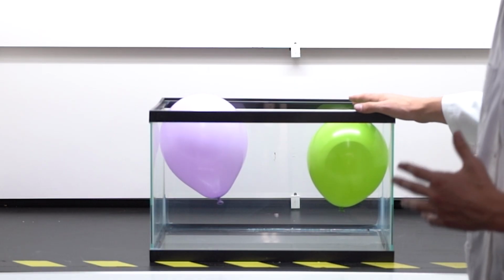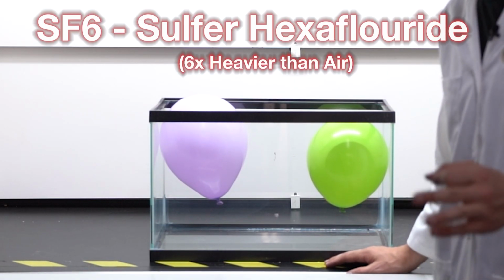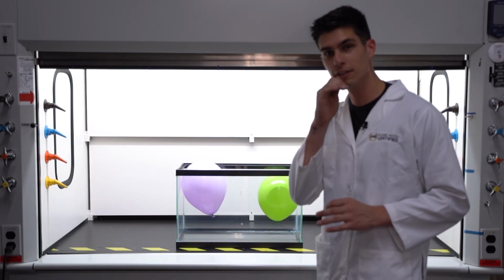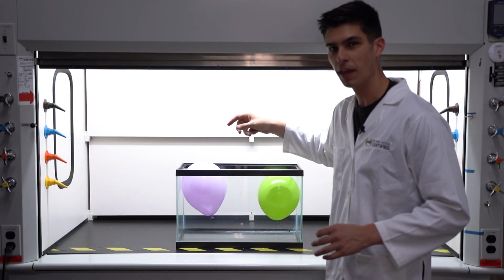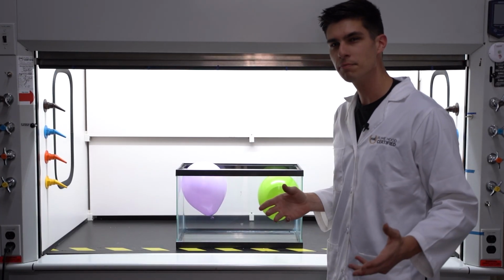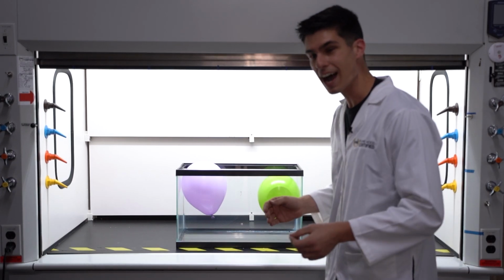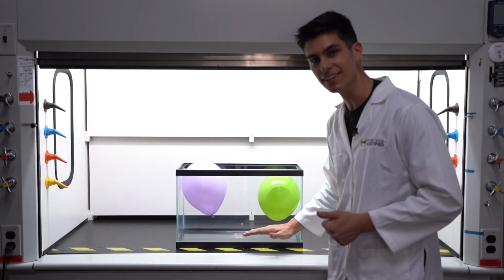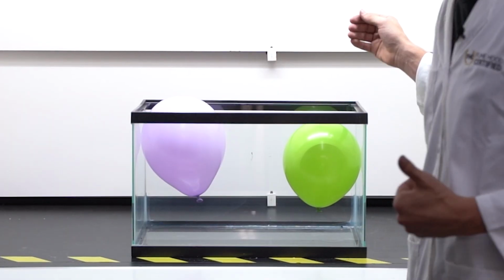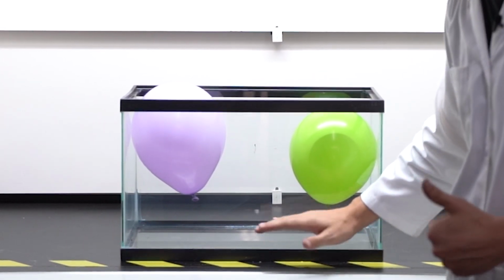Here we have a small aquarium, and in the bottom of it, we filled it with SF6, or sulfur hexafluoride. Then we took these 2 balloons that are just filled with regular air, and we set them in there. And surprisingly, they're literally floating on top. Why? Because sulfur hexafluoride, or SF6, is 6 times heavier, more dense than the regular air. So these balloons have no problem just literally sitting right on top of the layer of SF6.